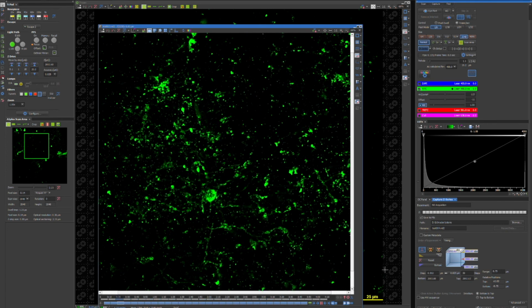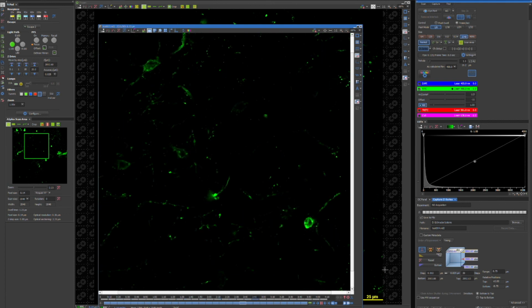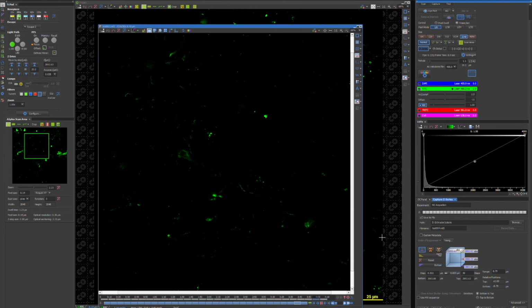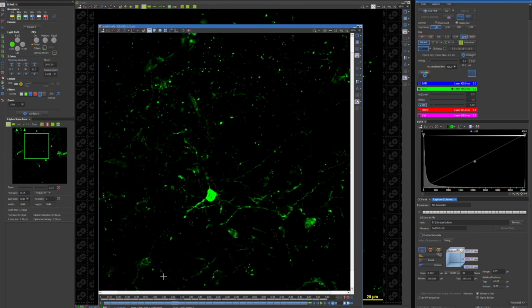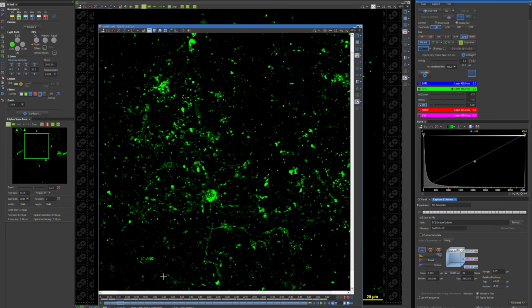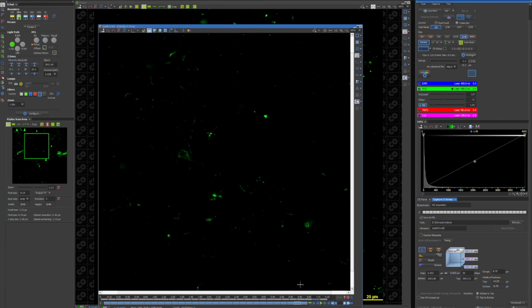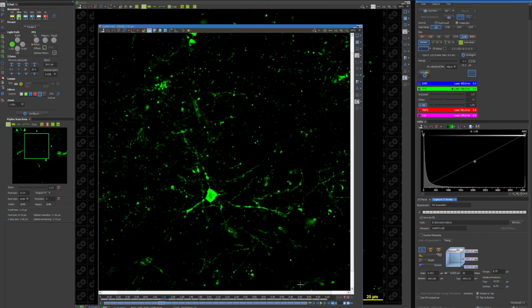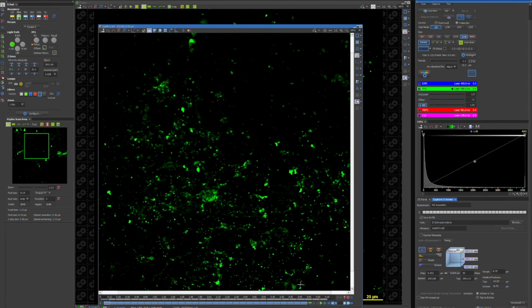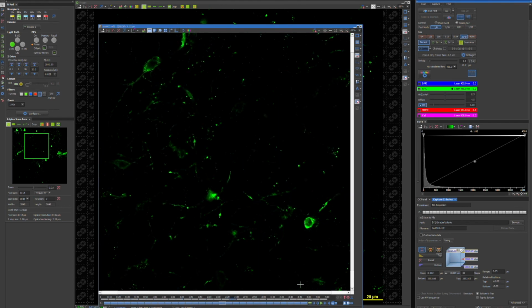So my process was by no means exact, and I'm still trying to tweak a few things like the actual technique of putting on the dye, but for now I think I'm going to wrap up the YouTube side of this project and call it good. I'm really happy with these pictures, and any future iterations on the project would just be small tweaks to the final product. However, if I do end up mastering the procedure at some point in the future, I might do a follow-up video to really demonstrate the incredible uses of DiI, because this is only the beginning.